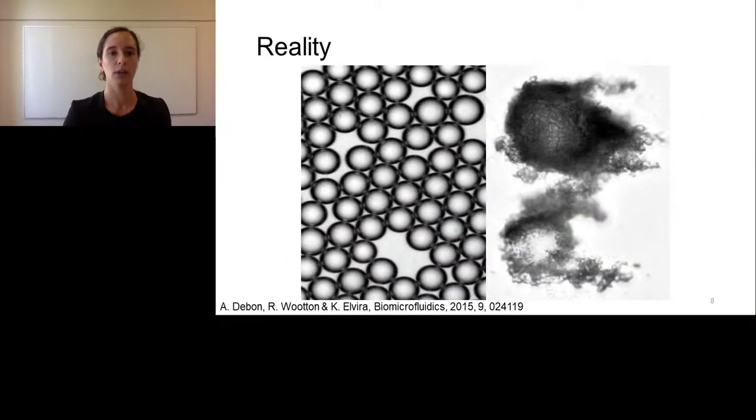So if you look up images of droplets, if you just Google microfluidic droplets, you'll see a lot of images like I'm showing right now on this slide. And they're beautiful, they're spherical, they're self-contained, they're totally distinct, and they're constant volume. Overall, we say they have integrity, but if you look at those images, they effectively glow on the edges, they're so beautiful.